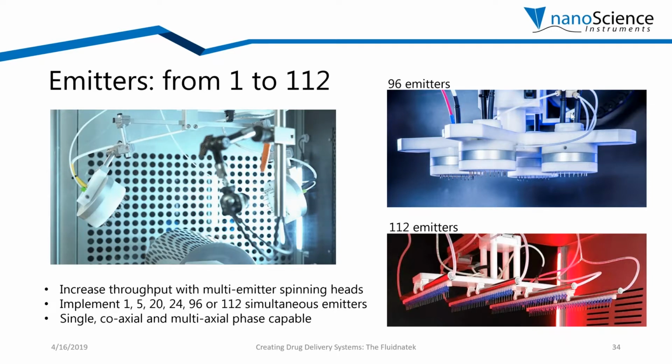If we want to use 96 emitters, or if we want to go all the way to 112 emitters to be used simultaneously to increase sample throughput.